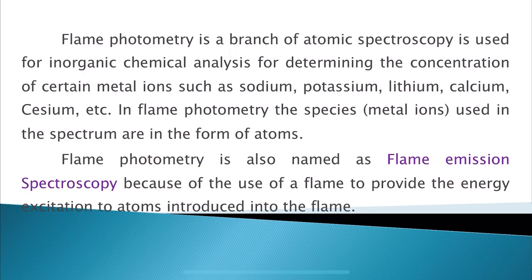So now let us move on to the introduction part of flame photometry. What is meant by flame photometry?